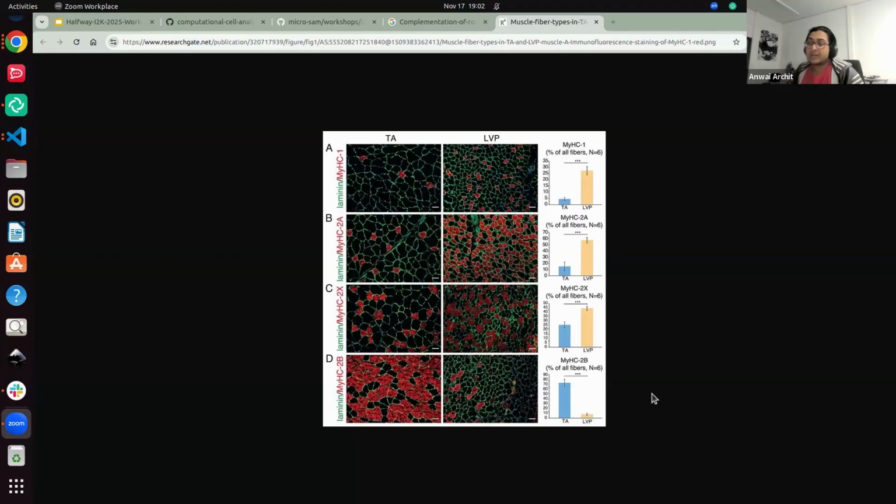You can run these very fast with these M chips, for example, or get a GPU at hand so that you can do the first step of computing the embeddings. You have an RTX 2060. I think that's good. For this data, this is pretty good, I would say. So this should do a good job for you, and you can do this on one laptop if you have an RTX 2060. That should be the way to go.